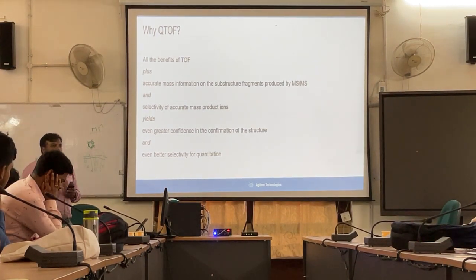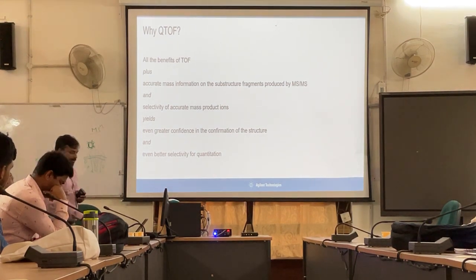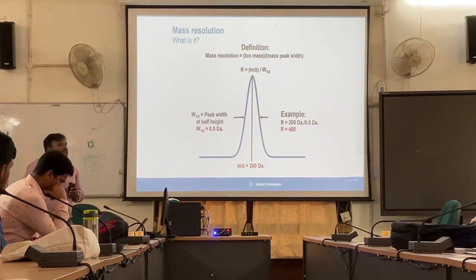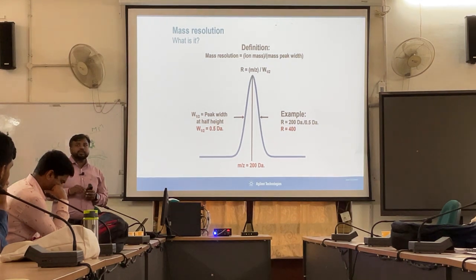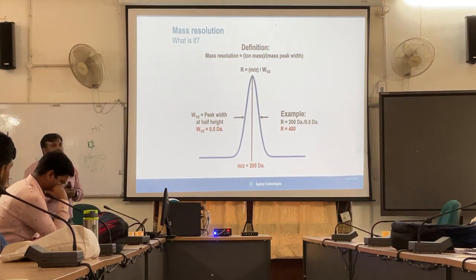So wherever in industry we are using targeted analysis, like proteomics and metabolomics, in those fields we can use the QTOF as a technology. So we are saying that this instrument is used as a high resolution mass spectrometer. So what exactly is resolution?